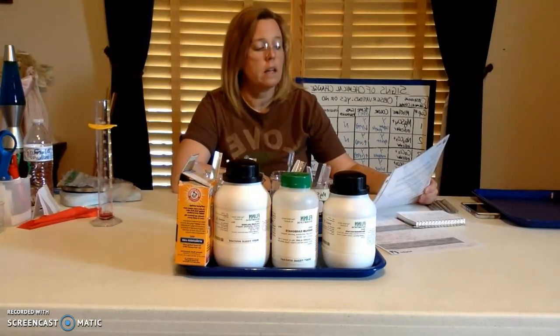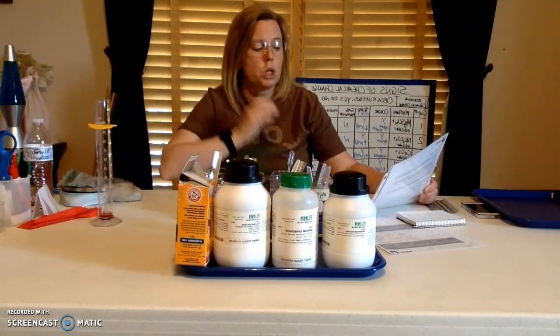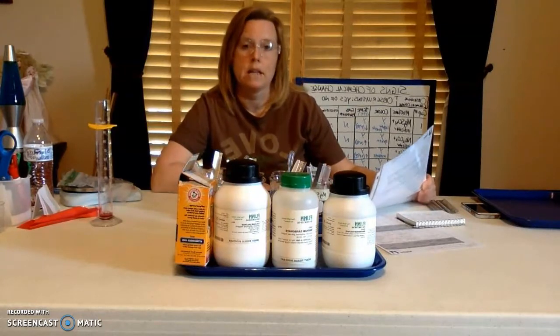How can we tell in the laboratory if a chemical reaction has actually occurred? So what I have done, and then it continues to read, conduct a series of chemical reactions and observe firsthand some of the indicators that a chemical reaction has taken place.